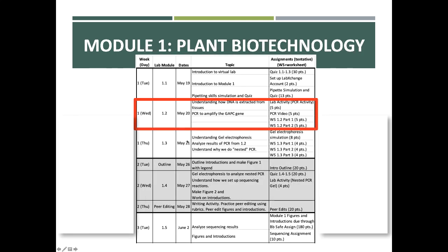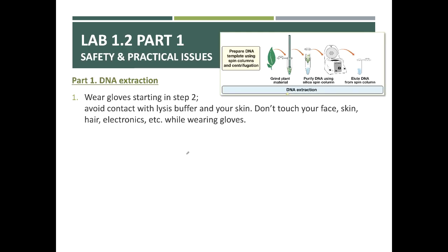We're going to talk about DNA extraction and PCR. Now, even though you're not going to be doing these actual steps, I do want to talk about them so that you're able to complete the worksheets, and also so that you understand some basic principles for when you do have an opportunity to work in a lab.